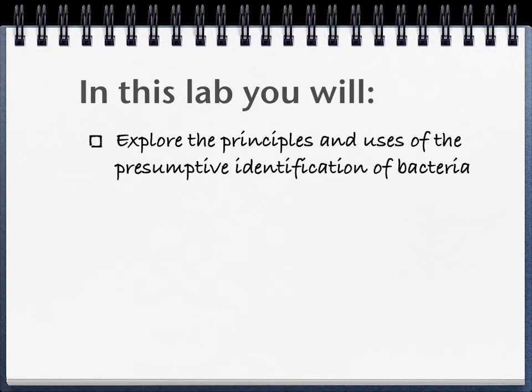All right, so lab 17 is all about this thing here, right? The concept. Why is that in black? This is our concept. We want to talk about this presumptive identification, right? So we want to talk about what a presumptive ID is and how we use a presumptive ID to identify bacteria, okay? Because they have their uses, but they also have their negatives. Pros and cons to everything, always, right?